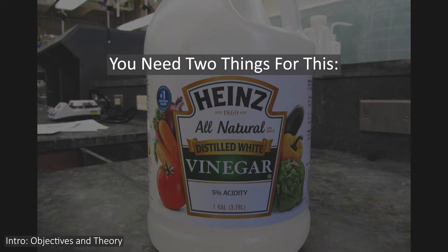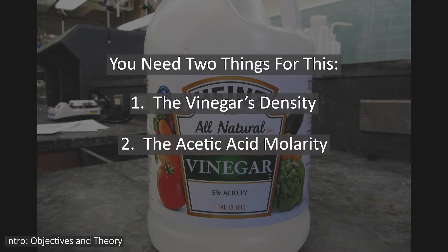To determine the mass percent of acetic acid in your vinegar, you need to figure out two things, those being the density of your vinegar and the molarity of acetic acid in it.